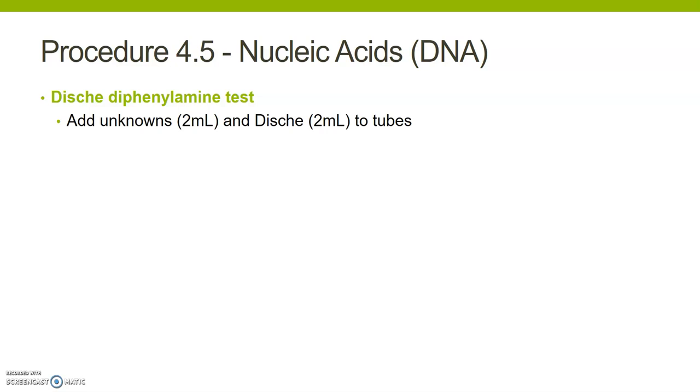Now, in order to get this reaction to happen, we need a little bit more than just swirling it in the tube, right? For this one, we do have to boil it. So in the lab, we actually do this underneath the hood because it smells very vinegary. It's a little volatile as it boils. So it's all done under the hood in hopes that that smell and those molecules will get taken out of the classroom by using that covered hood.